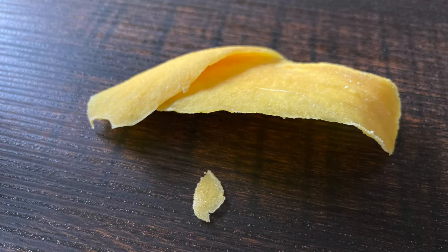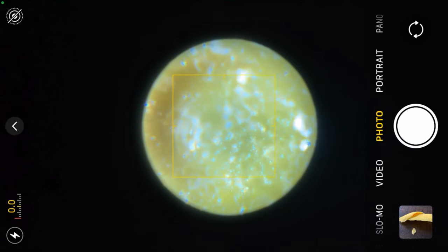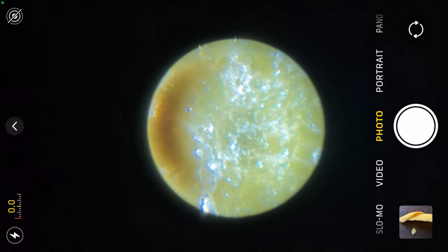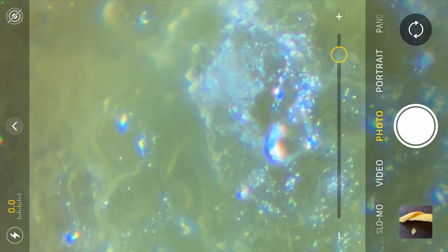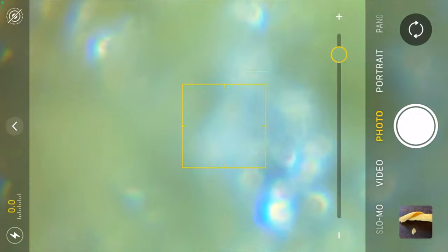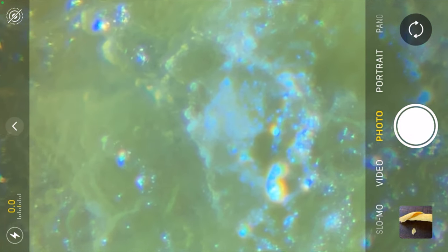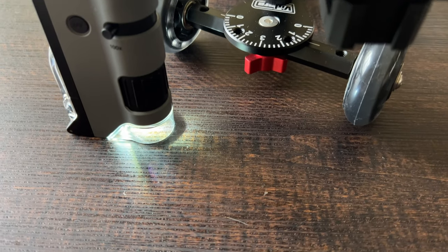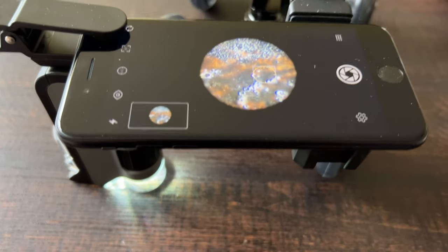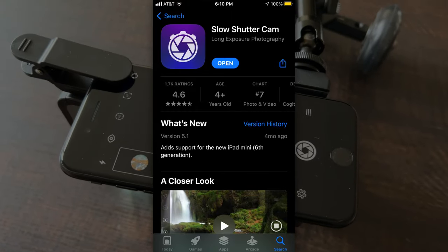I tried again with a strip of dried mango — I tore off a piece and took a closer look. The view was similar to the lettuce leaf, except the image was yellowish instead of greenish. That's because the LED light really floods the object with light. This is necessary to see the object, as the image is extremely dark without the LED light. It's not an insurmountable problem though — if you can keep the microscope and camera extremely steady, you can use an app like Slow Shutter Cam to use natural light.